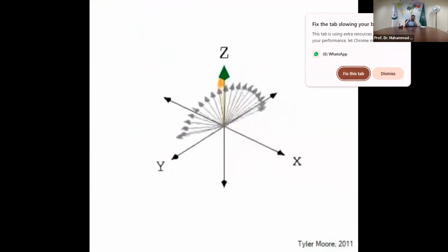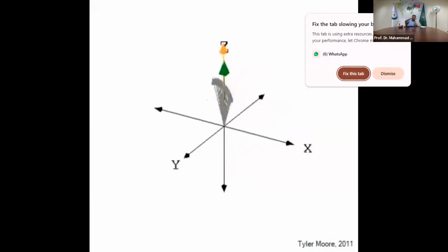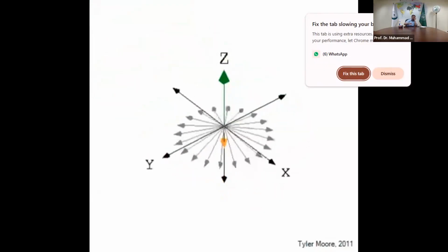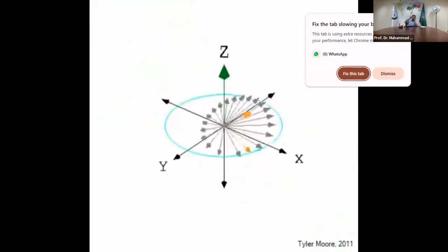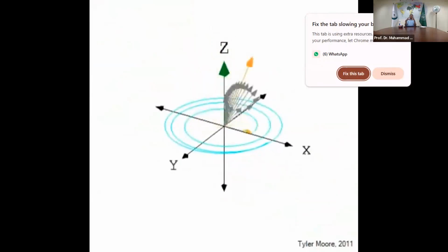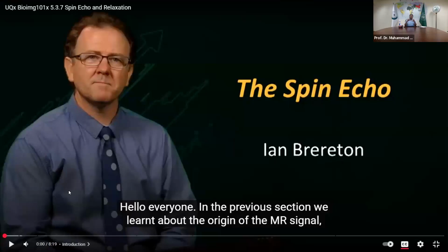And remember the 90x pulse brings it to minus y when it is on the negative direction. But slowly, with every time delay, it will be on the positive side. From minus z to plus z, you are recording various experiments with the difference of only delay, and that is critically important because then you know the position of that.